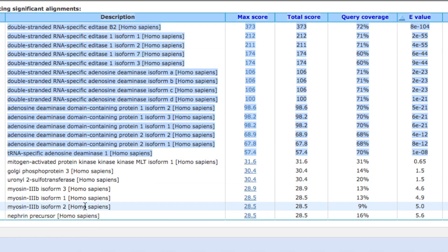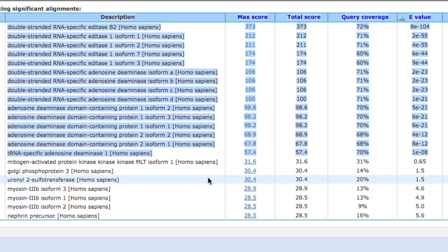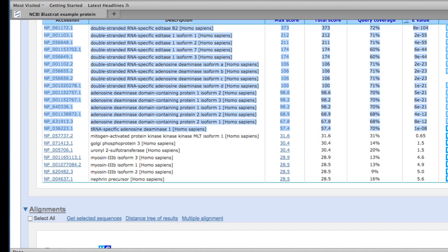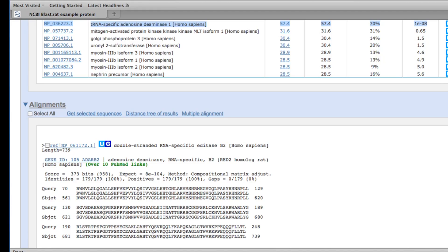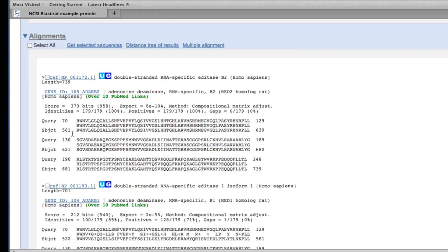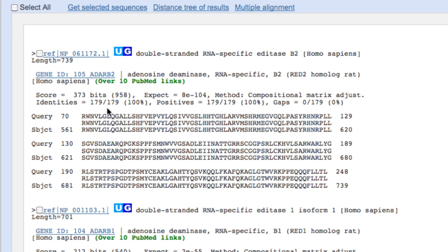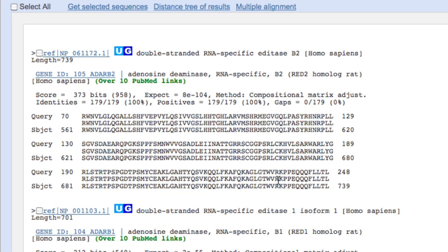Anything below that line, we can't make any conclusion about because the aligned region is a little bit too short. So there are about 12 homologues to that rat protein in human. And if I scroll further down, I can actually see the alignment. And if you notice the first alignment, there are 179 amino acids that match exactly, so there is a good chunk of this rat protein that matches the human sequence. This is a nearly identical — in fact, exactly the same — sequence.